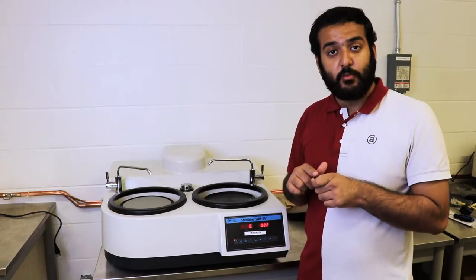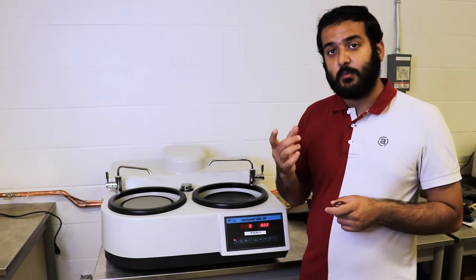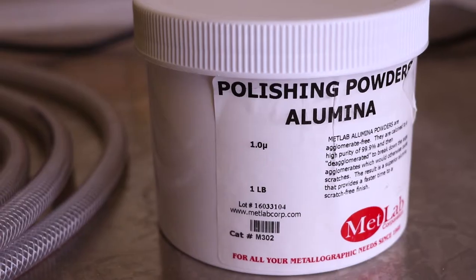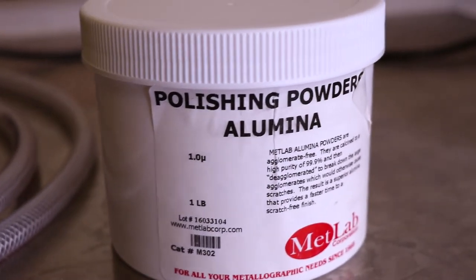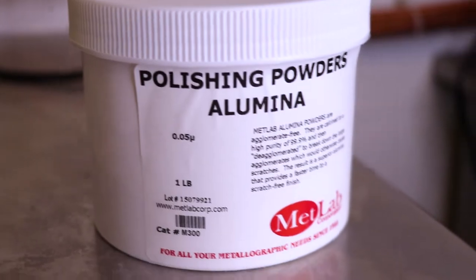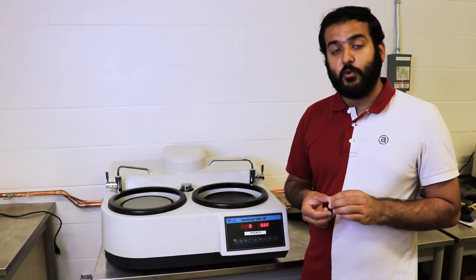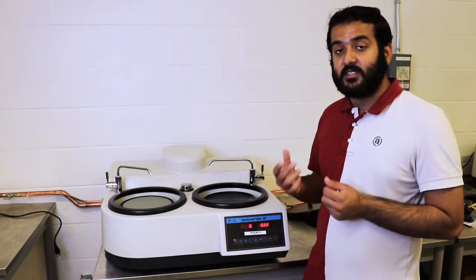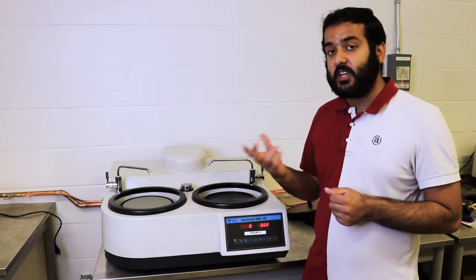This powder that we're going to be using is called alumina, and it comes in two different sizes: one micrometer and 0.5 micrometers. We're going to start with one micrometer and move on to 0.5. The way to apply the polishing pad is the same as it is for the sandpaper. There's a ring around the rotating plate that you want to remove and add the pad onto.